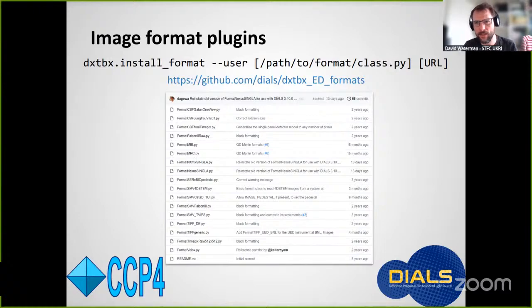And particularly the electron microscopy formats tend not to have the ability even to record all the crystallographic metadata. Or they might just be very general, like TIFF, which contains no useful diffraction geometry metadata at all, and can collide with other X-ray formats, like the TIFF formats used by old Rayonix X-ray detectors and so on. So supporting all this out of the box is very hard.